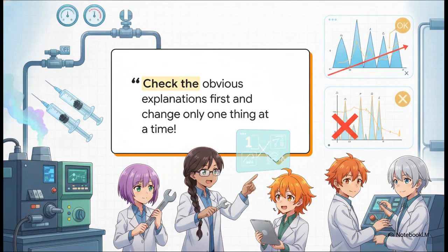Okay, I want to pause real quick for a dose of everyday lab reality. Gas chromatographs are incredibly sophisticated, highly sensitive instruments, which means things go wrong. Baselines drift, peaks get smeared into oblivion, signals just drop out entirely. The golden rule of troubleshooting, which is perfectly hit on the head by the Shimadzu guide, is to check the obvious first. Is the syringe physically blocked? Is the carrier gas actually turned on at the tank? Did the temperature program load right?